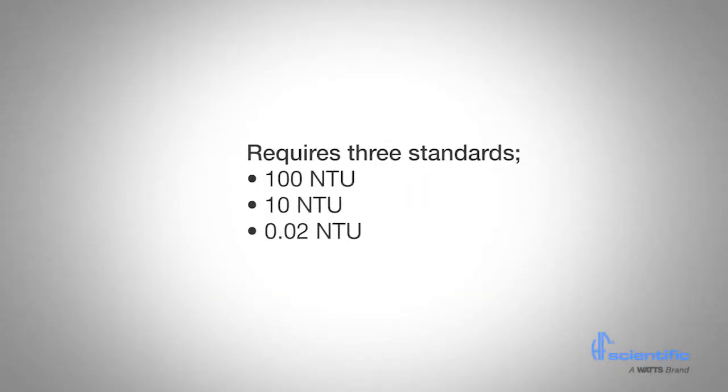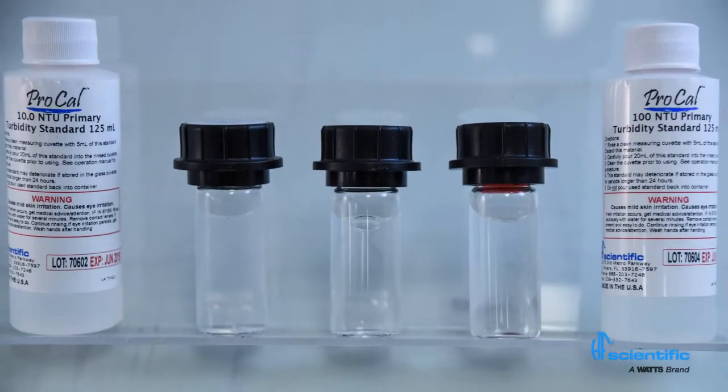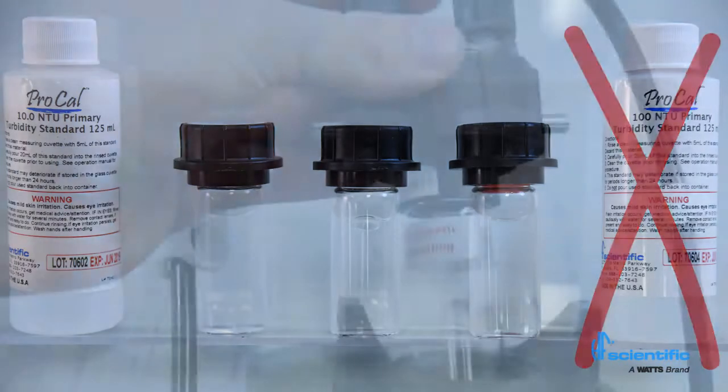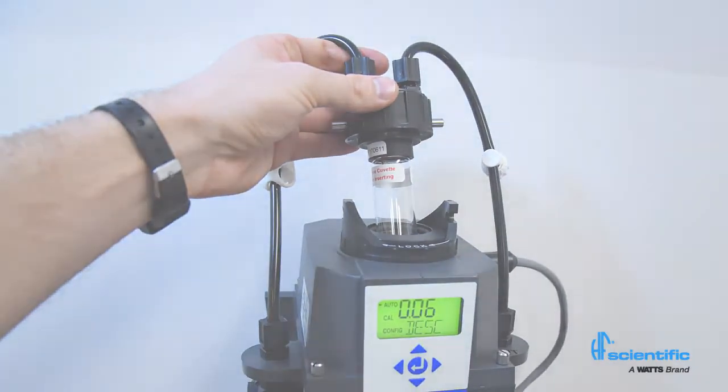A full calibration requires 3 standards at 100 NTU, 10 NTU, and 0.02 NTU. The MTOL Plus offers quick calibration that requires approximately 25mL of the standard solution and 2 minutes to complete. If readings above 10 NTU are not required, the step for 100 NTU can be omitted. In this case, the last valid 100 NTU calibration value will be used for any readings above 10 NTU.